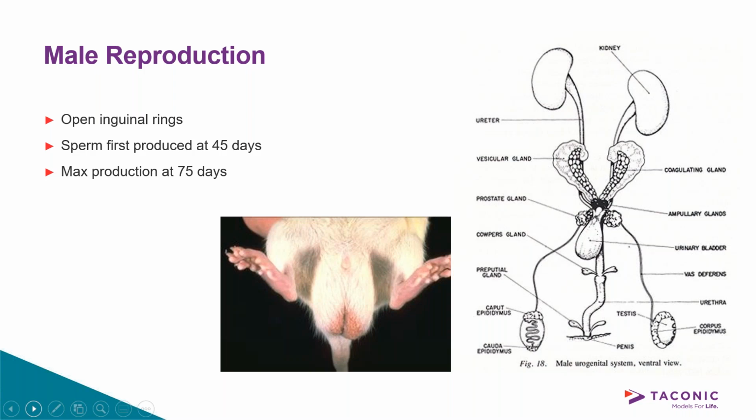It can be a little confusing at first if you're doing dissections to tell what some of these organs are. Guinea pigs tend to trip up a lot of people, where the coagulating glands and the seminal vesicles of the guinea pig can look a lot like uterine horns. But if you really understand the normal anatomy, then it's much easier to see when something might be abnormal in the animal.